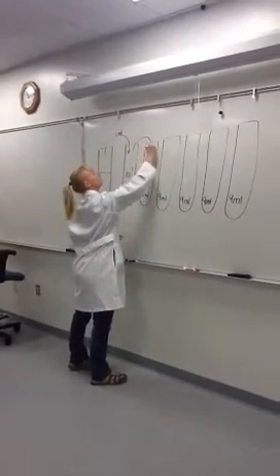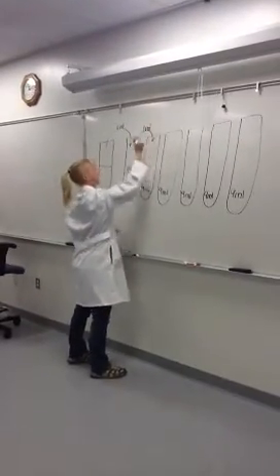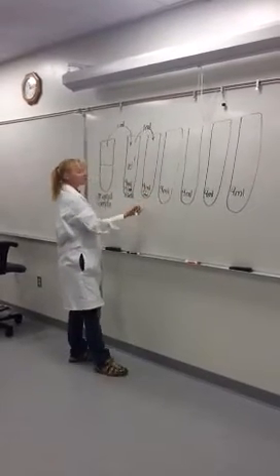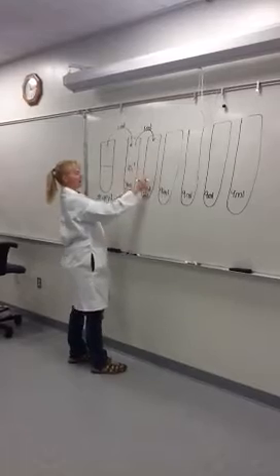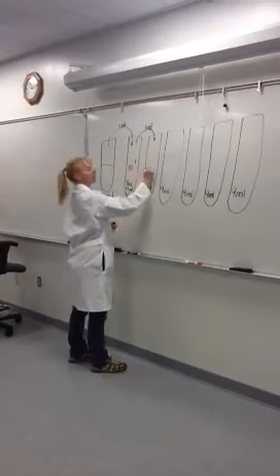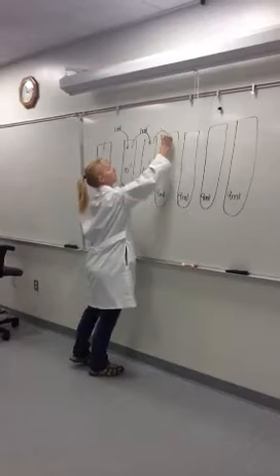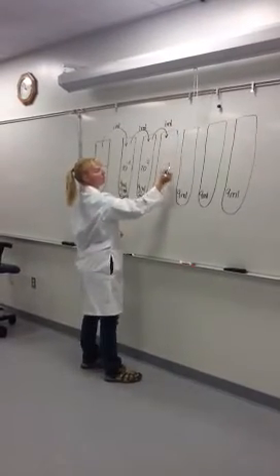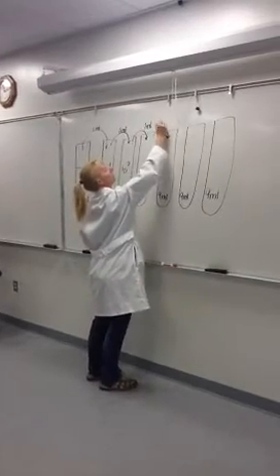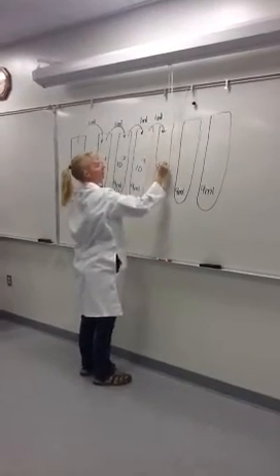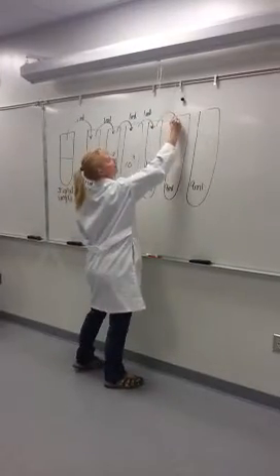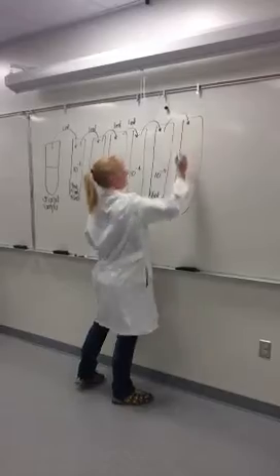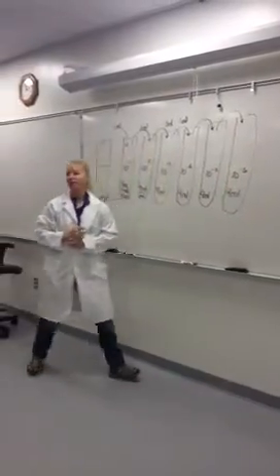There's also little devices that you can get that you put your test tube on there and it does this little wiggle thing with your test tube if you're too lazy to swirl it. So after that, you would move another one milliliter. And so now, again, you've added one in here. This one is a tenfold dilution of this. So now it's a hundredfold. Move it again. The dilution becomes to the negative third. One milliliter again. And so on until you get down to the end.